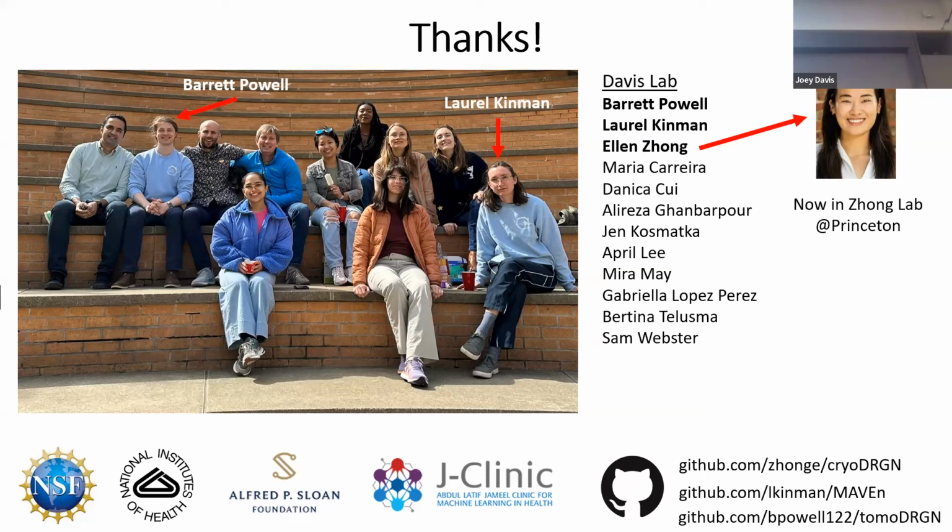You can conjugate those to antibodies and then use the antibody as an affinity reagent to label your particle of interest. The challenges there are delivery, and do you have to lyse the cells first, or how do you get them in? But I think it's a super cool approach because, like you say, it basically just puts a big flag post and says, hey, I'm here. And then you can use all the antibodies that we have for defining this.